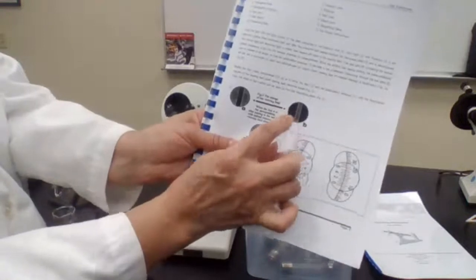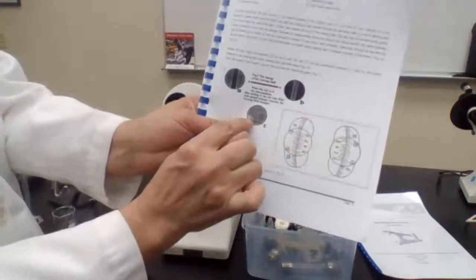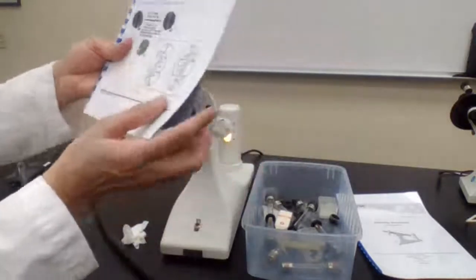Okay, we start with this, and we have to change it until we get to this view.